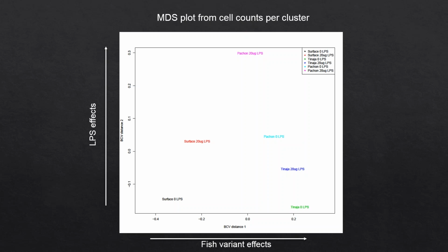Okay, so now I'm working with a slightly different data type. What this plot is generated from is the Xshift clustering environment called Vortex. Once you run all the clustering, you can make a table. Every row is a cluster, and the columns are counts of cells in that cluster by sample. And so I can run this MDS plot in R on that, and that's very similar to PCA. It's a combination of higher parameter data.